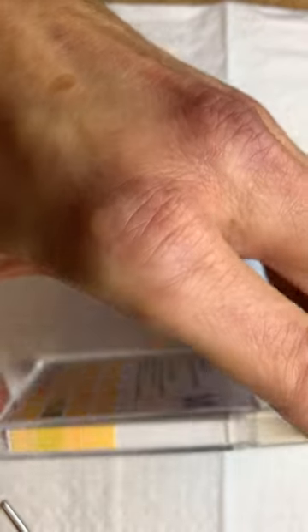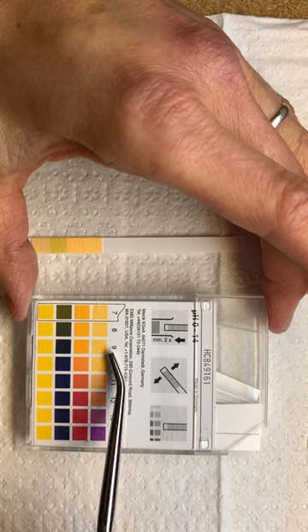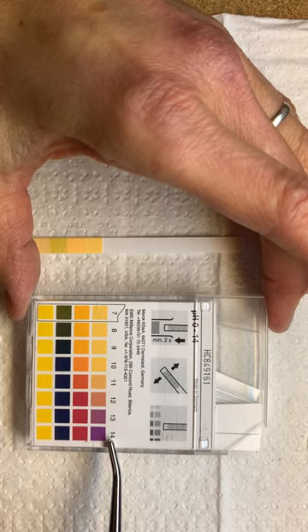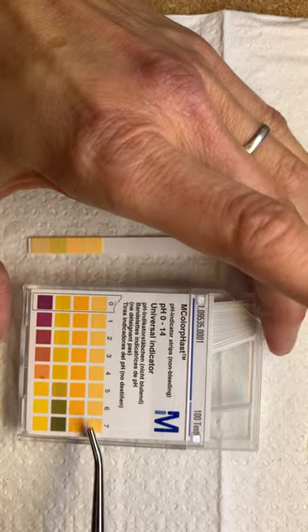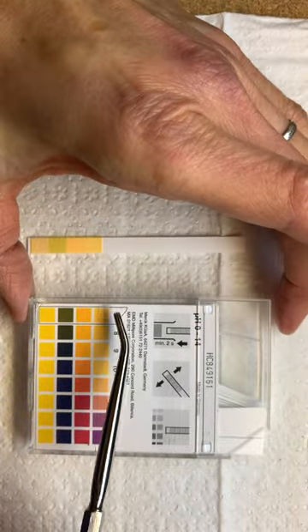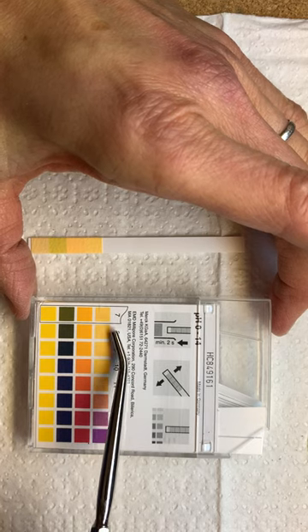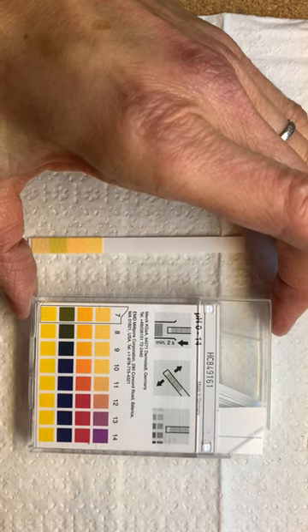If we flip the box over, we can see neutral again at 7, going all the way through 14. So the box shows us acids on one side ending at 7 which is neutral, and then bases on the other side beginning at 7 and going all the way through 14.